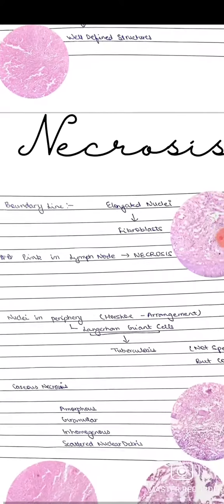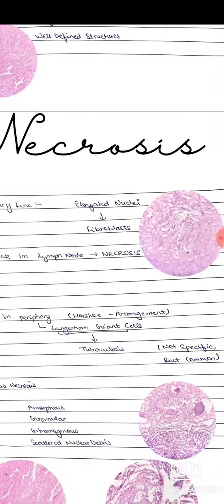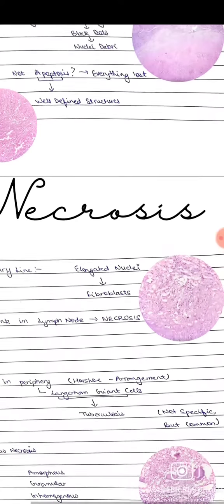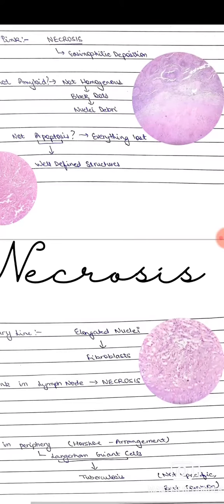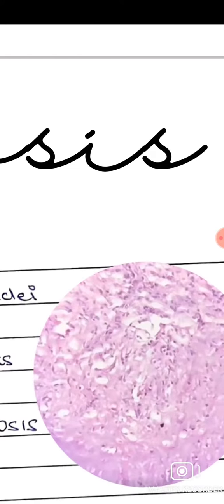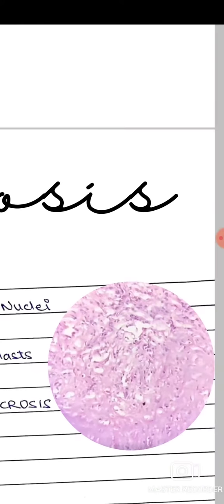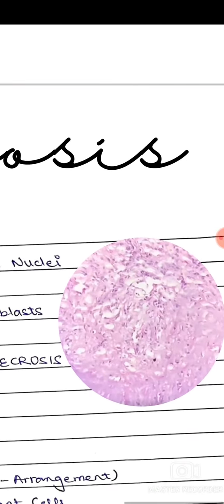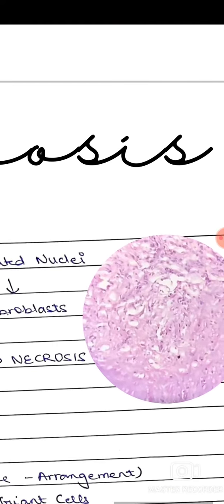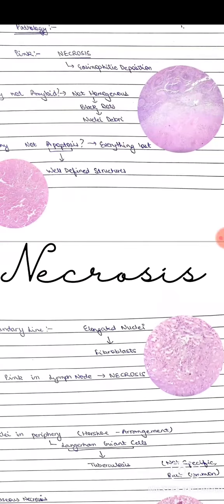When we look at the boundary line between the normal portion and the necrotic portion, we see cells with elongated nuclei. These cells are known as fibroblasts.